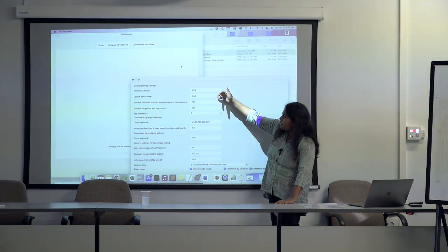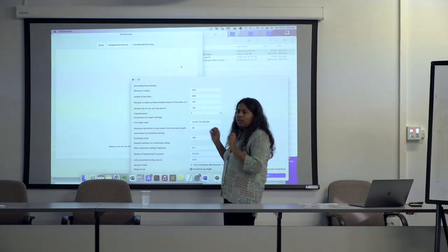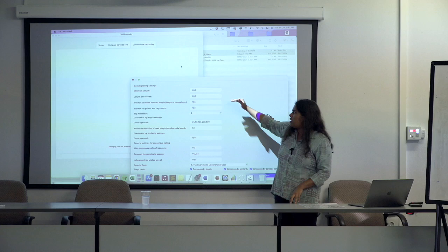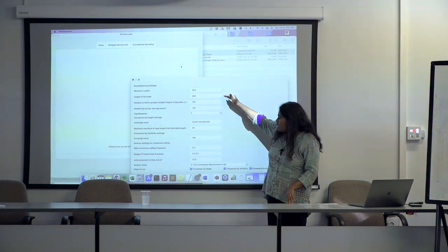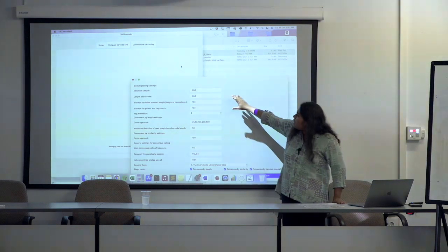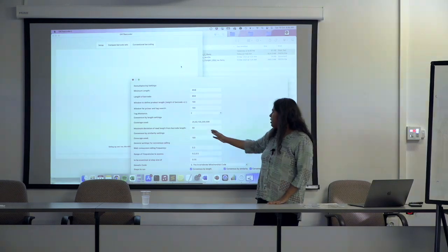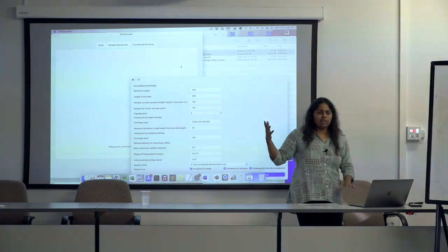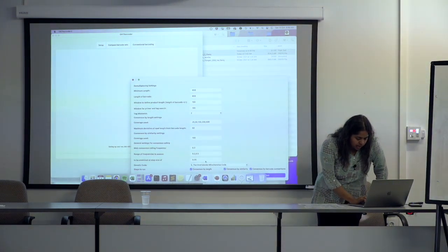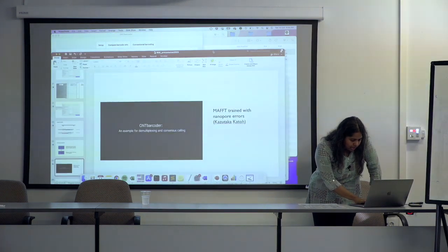This criterion, of course, ignores real amino acid indels, but I think this is almost a needless step now with 10.4, because the reads are getting quite accurate. So with the QCs, we are able to judge whether your barcode is okay, and then move on to, okay, maybe this bin needs more reads. This is essentially what's happening with the iterative coverage analysis if you have set it up under the defaults.